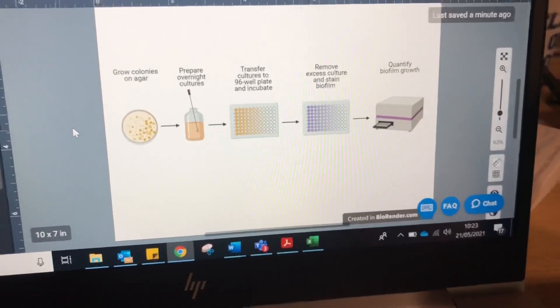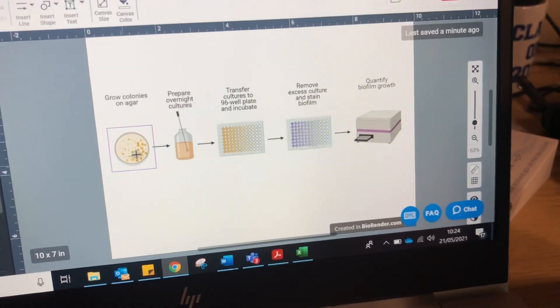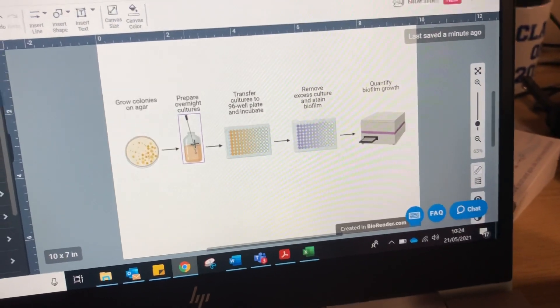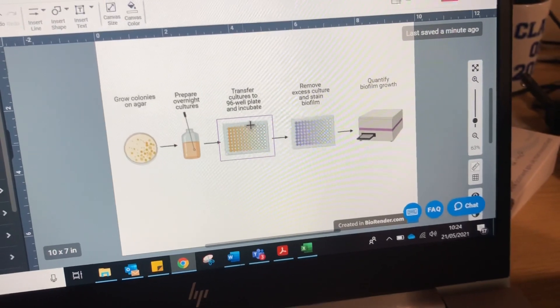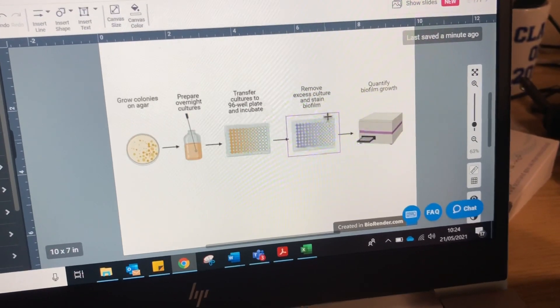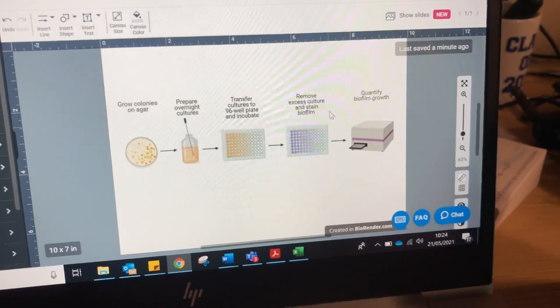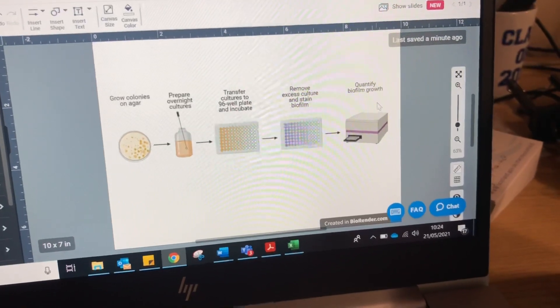What I do is I grow my bacteria on an agar plate in a petri dish and I transfer some of the colonies to liquid media to prepare overnight cultures, so I let them grow overnight. Then I transfer these cultures to my 96-well plate, leave them to incubate for 48 hours typically, and then I wash off the residual culture and just make sure that the biofilm is the only thing left behind, sticking to the bottom of the wells. Then I stain the biofilm using my purple dye, as you've seen before, and then I quantify my biofilm growth.